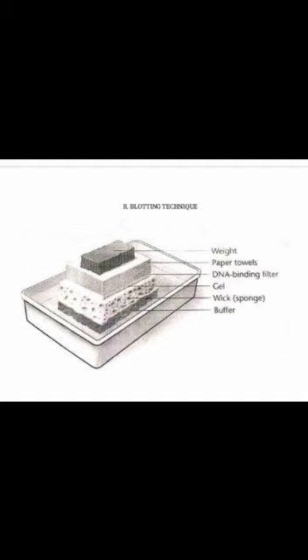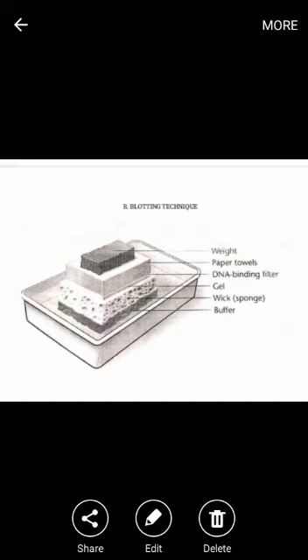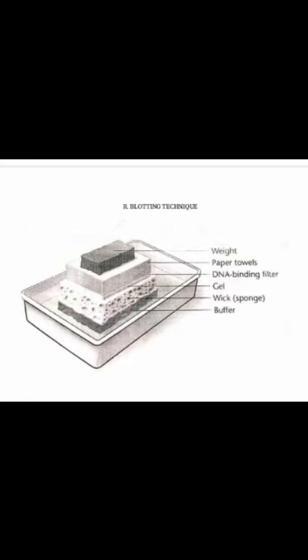And the next one is northern blot. This is similar to southern blot. RNA is subjected to electrophoresis before blot transfer. And the third one, western blot. This is for protein. Proteins are electrophoresed and transferred to special paper that avidly binds macromolecules and then probed with a specific antibody or other probe molecules.